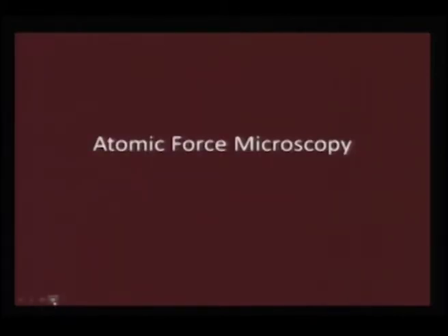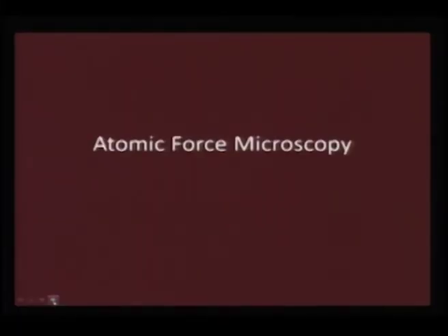Now, when we have a problem in trying to study non-conducting materials, what do we do? In that case, another technique which comes in handy is AFM. Now, AFM is more common than STM, because most labs can afford an AFM. The main reason is that you do not need ultra high vacuum conditions, and second, you can keep it in a very small place, it does not command as much attention as the STM. So, atomic force microscopy was developed 2 or 3 years after the STM was discovered.